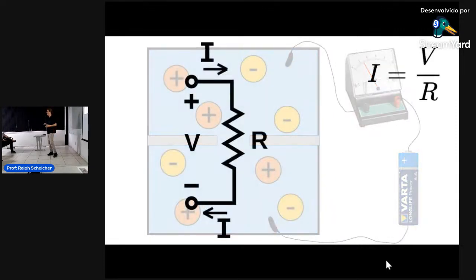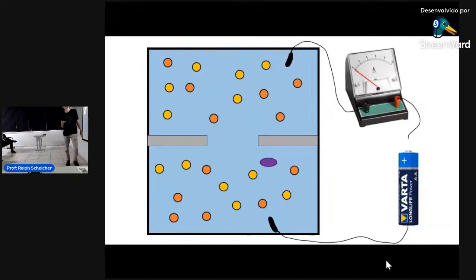So you can think of the nanopore as just a resistor. You can look at this just as a very simple circuit. You have a voltage source with current flowing. You can measure the current, and you have a resistor here. So Ohm's law is telling us that the current is inversely proportional to the resistance. So you see already now maybe the sensing principle. If I change something with the resistance here in the nanopore, I can measure this in the current. And that's exactly what we're doing.